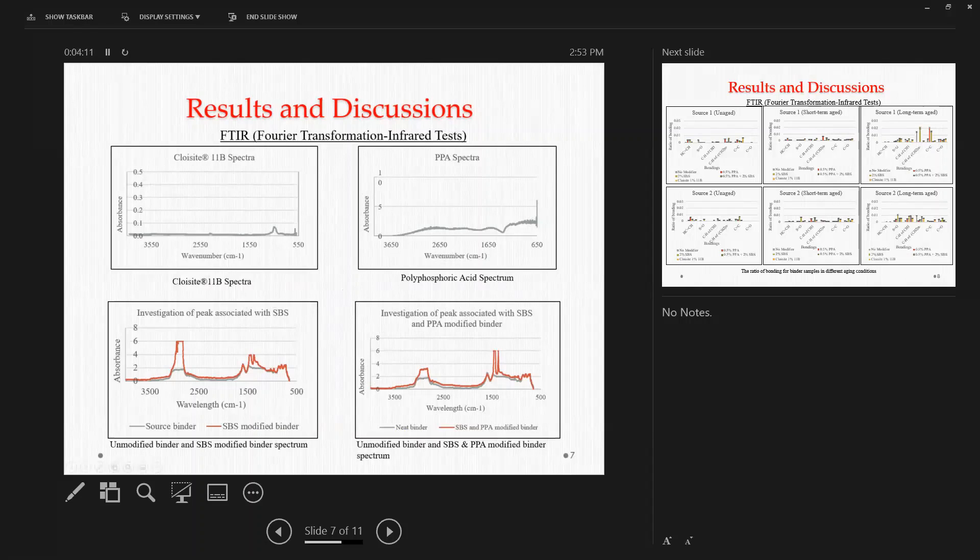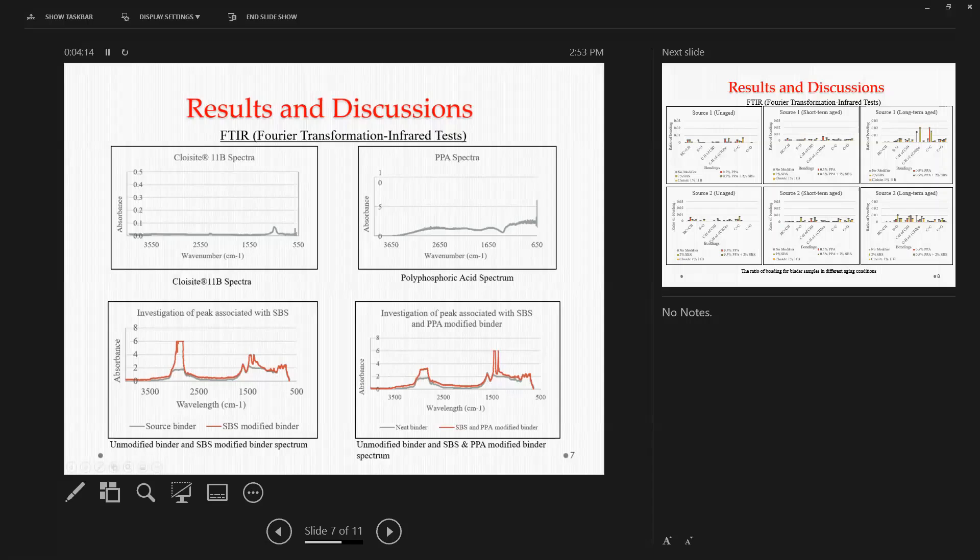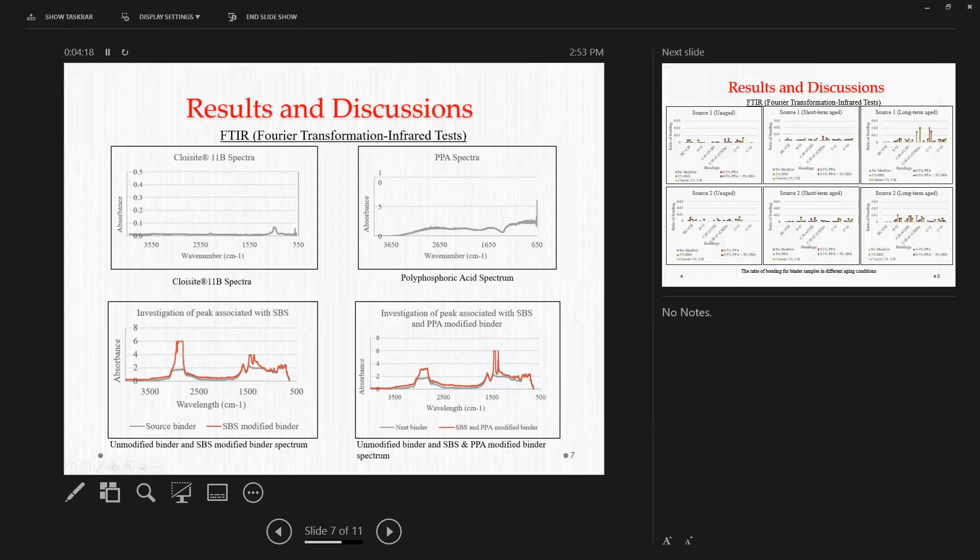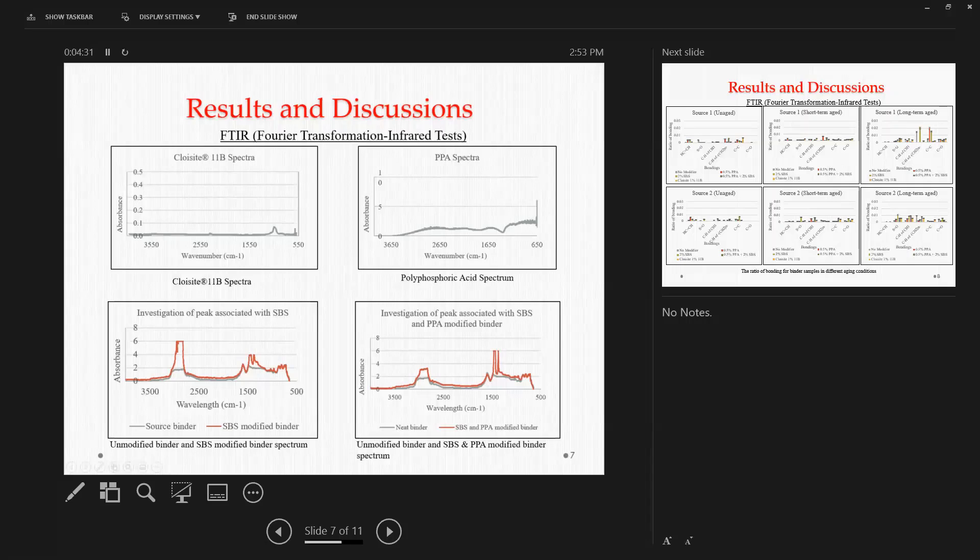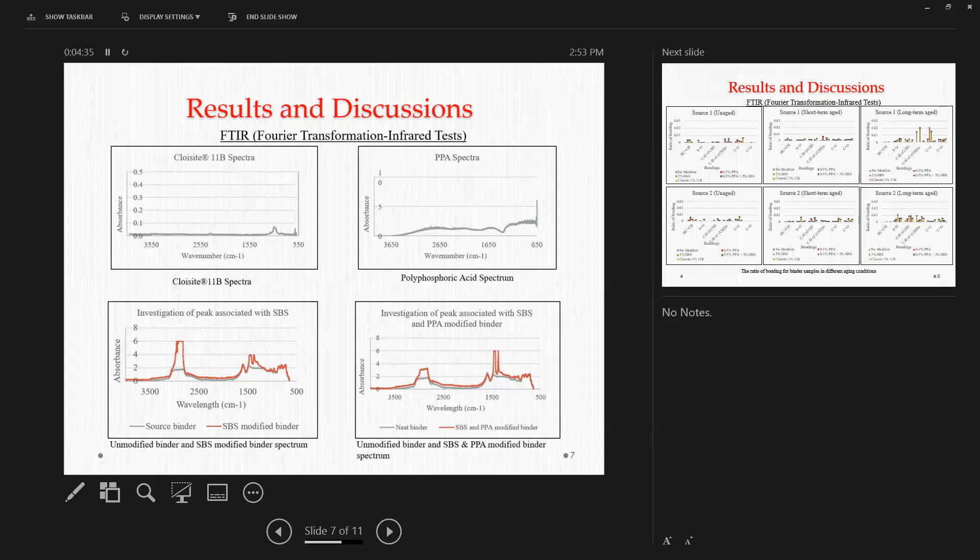For PPA, there were some ups and downs, but once again, there was no significant peak that can be associated or traced back to the polyphosphoric acid itself. But when we compared the unmodified binder spectra with the SBS modified binders, we found a significant variation in the peaks at near about 966 or 965 wavenumber.